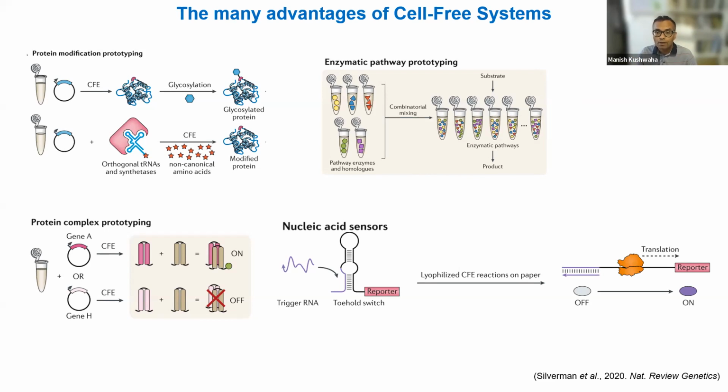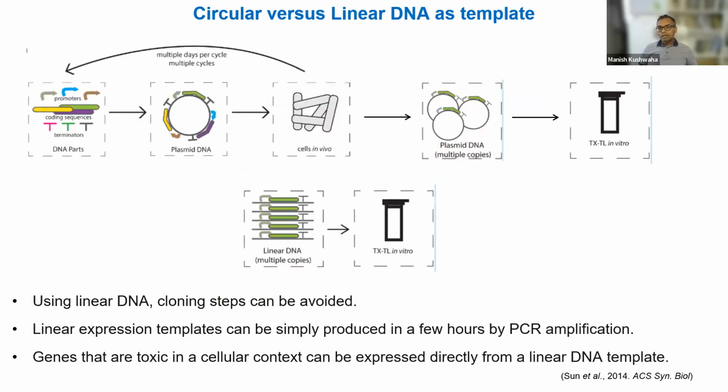Right, so most of the applications in cell-free typically use circular or plasmid DNA. And there has been for many years now this realization that making large amounts of this DNA is in fact not easy. Very often you run into cloning problems if you're trying to express anything.